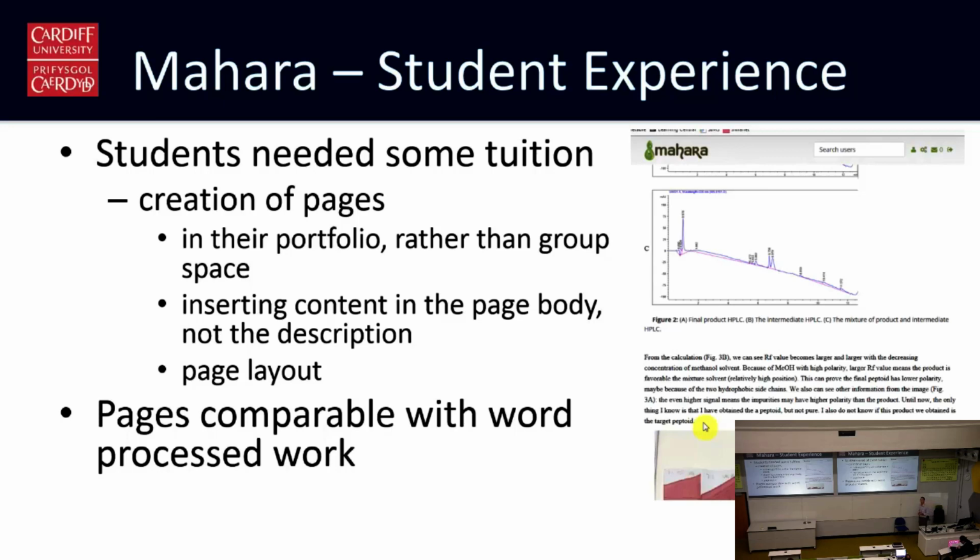So the experience was that the students initially had a few teething problems with the system. We had to give them a little bit of tuition on how to use it properly. So one of the problems was that students were creating pages in a communal area rather than their personal portfolio.